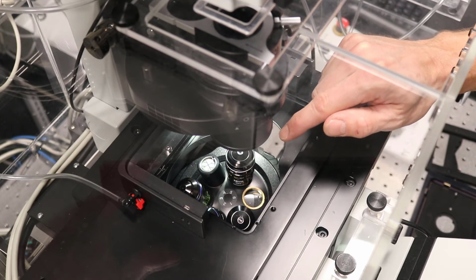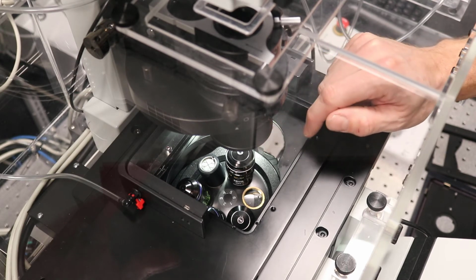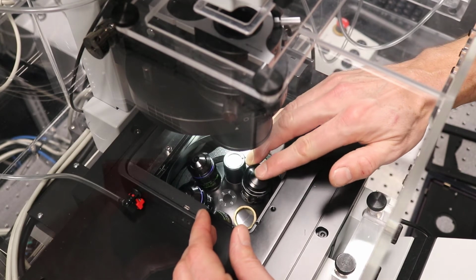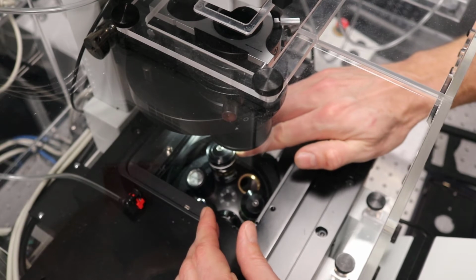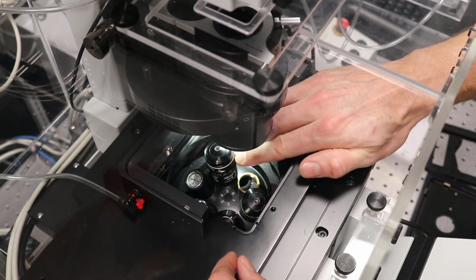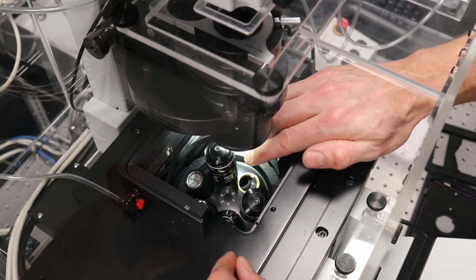The reason why there is a configuration that is not called TIRF is that when you use the wide field configuration, this is not in the light path, and you don't want to scratch this lens. So I'll move it manually because I show it this once. Otherwise you only move it manually in the software. You can see this correction collar, which is correcting for the focus for 2 different temperatures. So the white is the room temperature and yellow is 37 degrees.